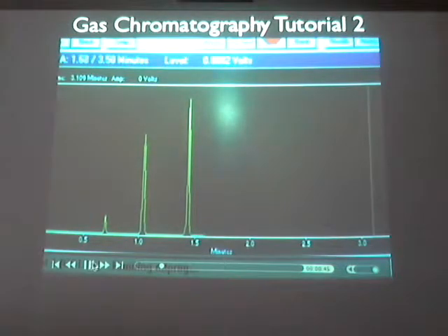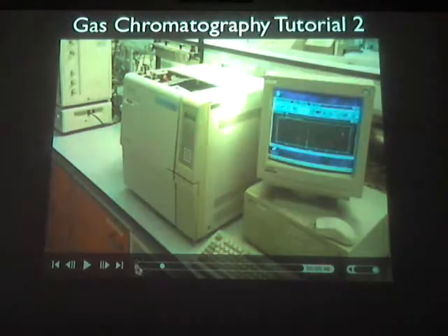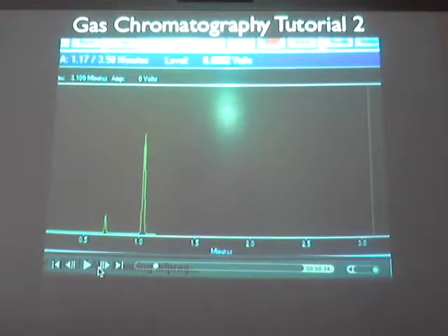I was surprised. Some people didn't know what the word volatile means. Let me kind of show you here. This bottom axis, this x-axis down here, that's time. That's how long it takes for the stuff to get through. So this stuff came out, whatever this peak is, came out very quickly. It must have been the lightest fraction, the part that vaporizes the easiest and it's lightest. That's what volatile means. Something that easily vaporizes, that's a very low boiling point, it's a very light fraction.